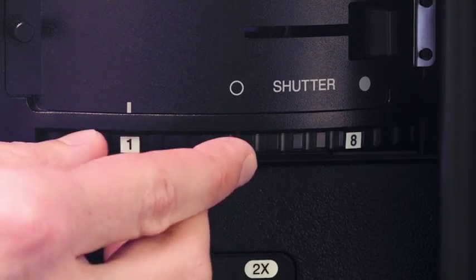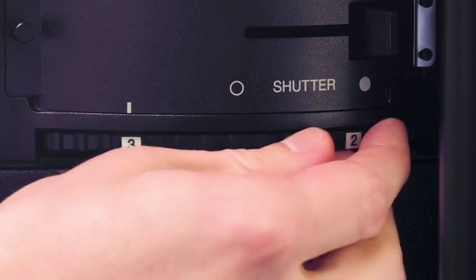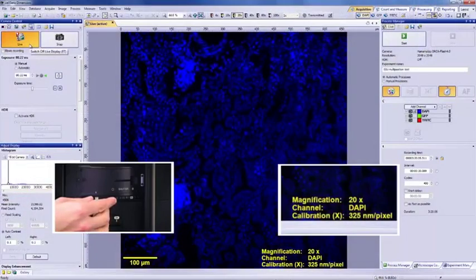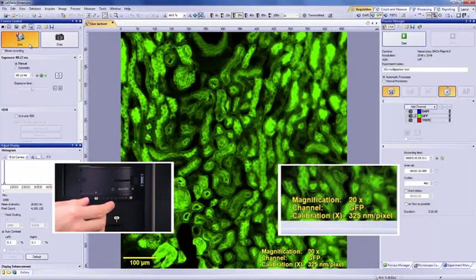For example, moving the fluorescence filter cube to it automatically updates the pseudo-color of the image being acquired on a monochrome camera. The channel information, such as excitation and emission light wavelengths, is saved into the acquired image as well.